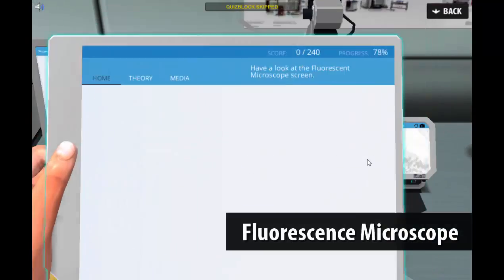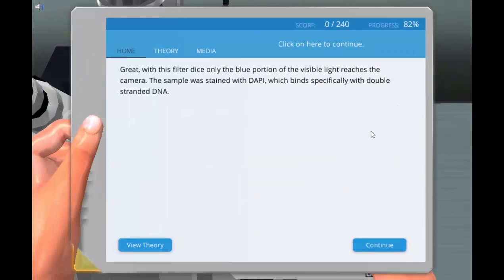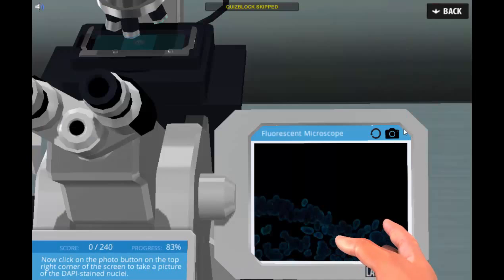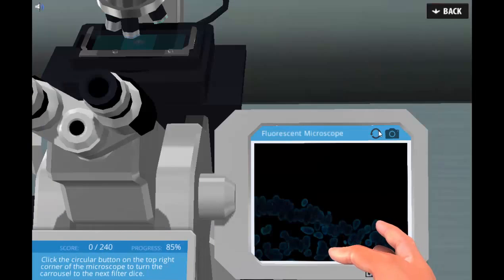Students also learn about fluorescence staining techniques and how they can be used to visualize specific structures. For example, by staining the DNA with DAPI, students can easily identify a cell's nucleus.